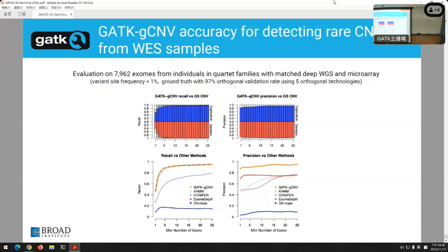You have mentioned the well-matched sample, 100 well-matched samples. How do you define well-matched? Is the trio, the parent of the trio, a good sample? Yeah, so you actually don't need families to make a well-matched set of samples for GCNV. You can use the clustering approach that I described later on in the slides to identify well-matched samples.